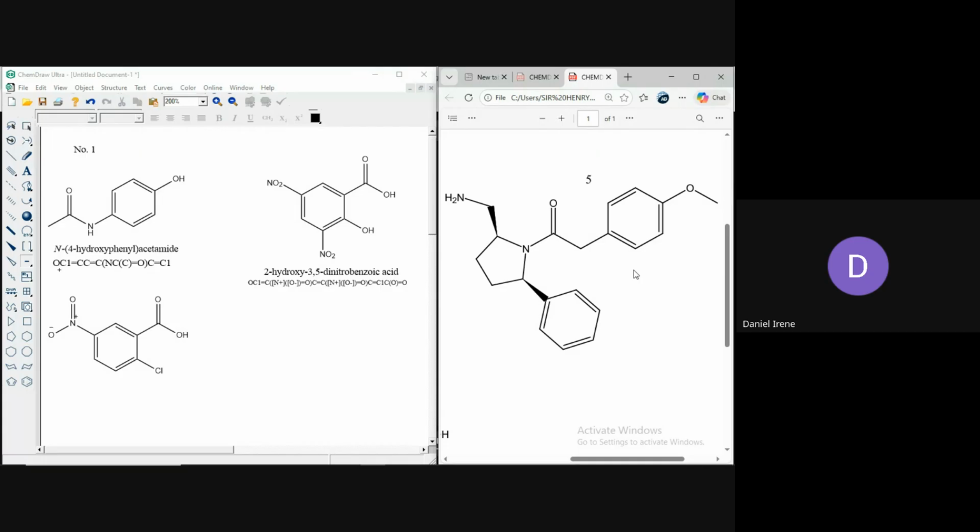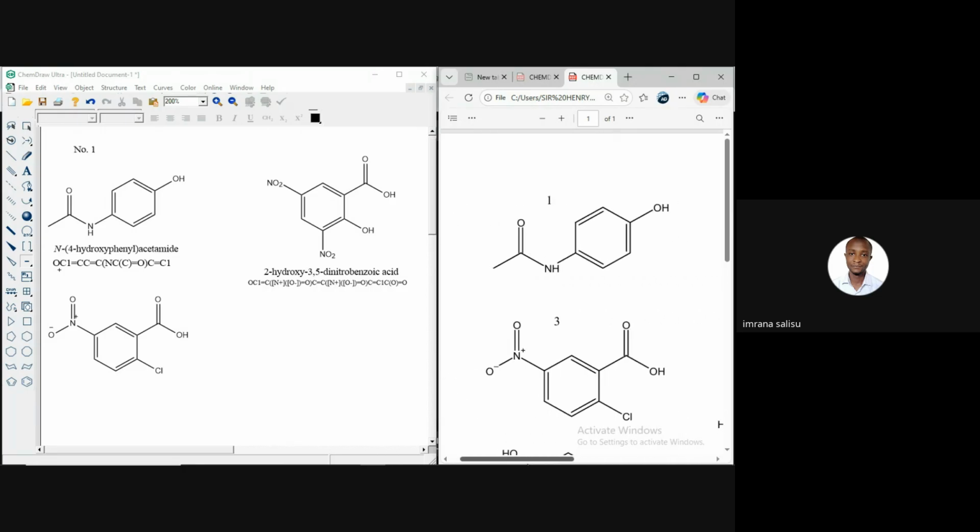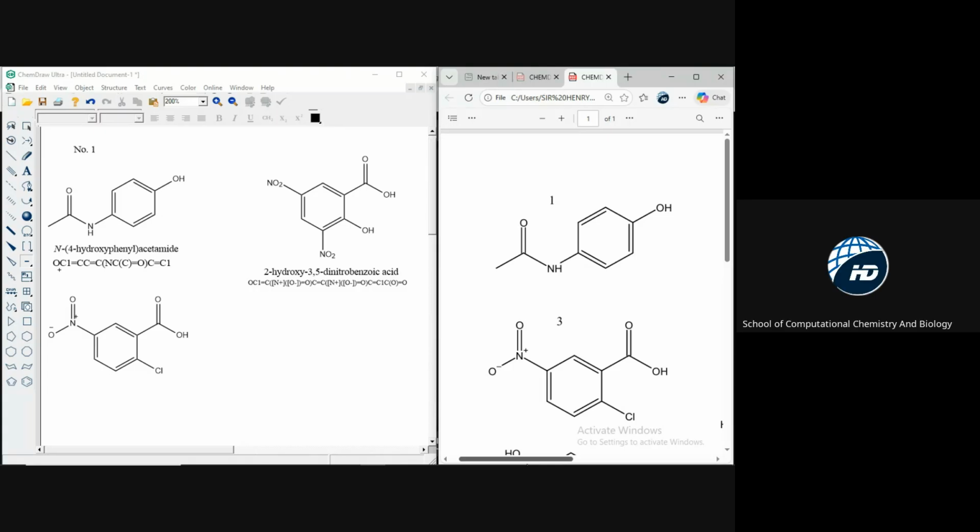It's fine now. Hello, sir. Is the structure number one. What happened to it? I said in the structure number one, when you were putting NH, the N was not on top of hydrogen, but after you did it, now the N is on top of hydrogen. It does not mean anything.